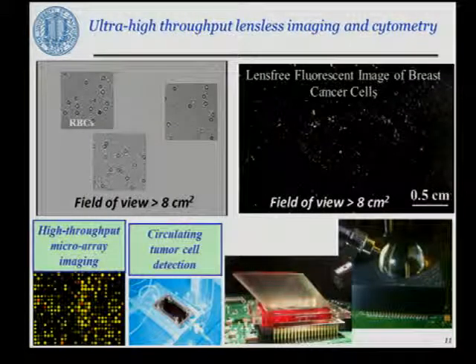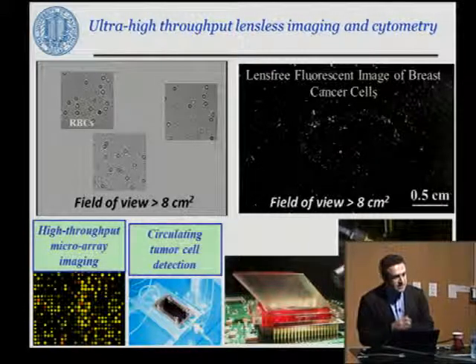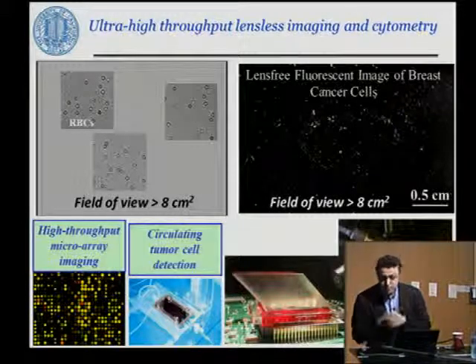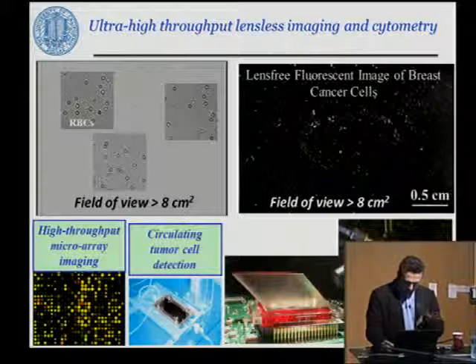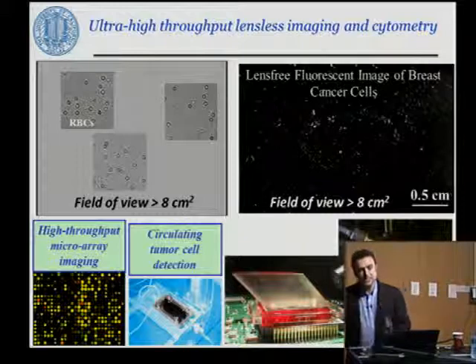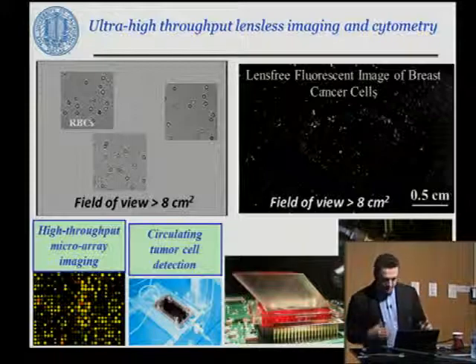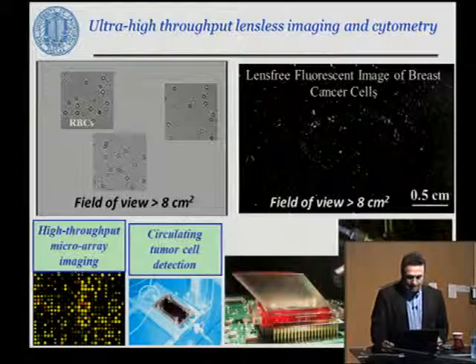I want to emphasize that the same framework is not only for mobile phone-based, CMOS-based imaging system design. It's also quite competitive if you combine them with wide format CCDs to look at extremely large areas on the order of 10, 20 centimeters square, which is quite large, maybe 3 orders of magnitude larger compared to traditional lens-based microscope design. This is going to come somewhere in the middle, just to give you a comparison, because whatever I'm going to show you in the next few slides as a platform is independent of the sensor type. I can select any different sensor type depending on my resolution and field of view need.